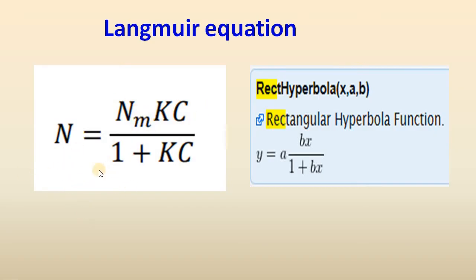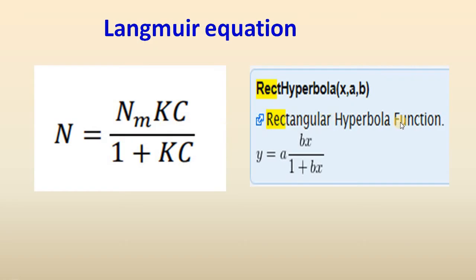A typical form of the Langmuir equation can be written as: n = (nm · k · c) / (1 + k·c), where n is the amount adsorbed, nm is the maximum amount adsorbed, k is the Langmuir constant, and c is the equilibrium concentration. If we compare this equation with the rectangular hyperbola function, we see that n equals y, nm equals a, k equals b, and c equals x. So if we fit the Langmuir equation with the rectangular hyperbola, we can easily calculate the Langmuir isotherm equation parameters.